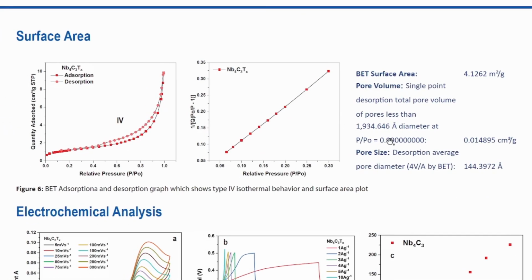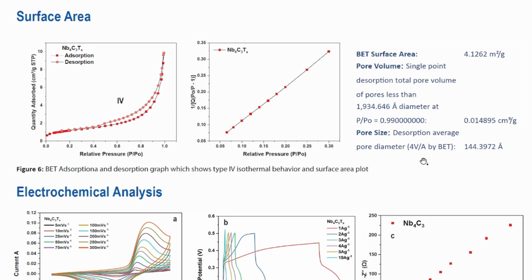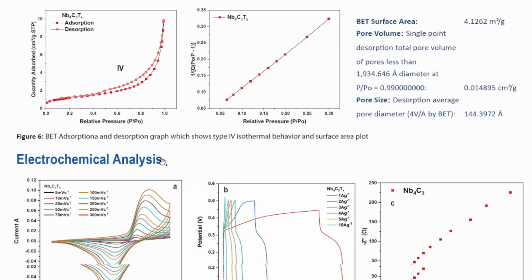Here we have also performed the surface area analysis, that is BET analysis. From BET we calculated the surface area as 4.12 square meters per gram and pore size as 14 nanometers, which is in the mesoporous range. And the isotherm plots show that the curve has a hysteresis loop of the fourth category.